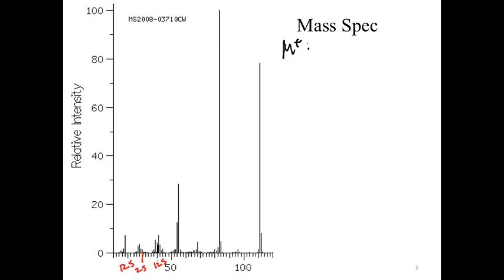Which means what we're looking at, let's make sure that this holds consistent. Sorry about that, I should have looked a little bit closer at the scaling. They abbreviated the front end of this too. We're starting at 40, 30, 20, so each of these markings is by units of 10. So if we go up to our peak furthest to the right, look really carefully, there's a little guy right there. So 110, what we're looking at is a signal at about 111.